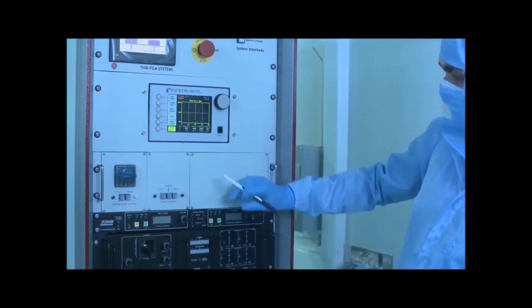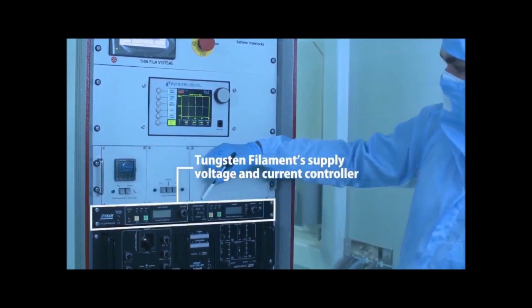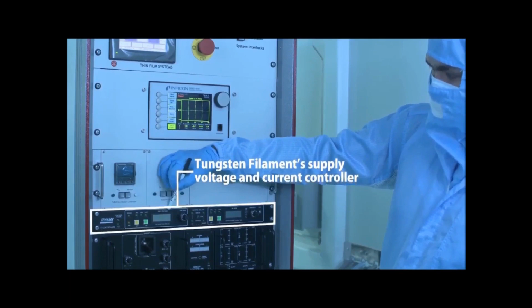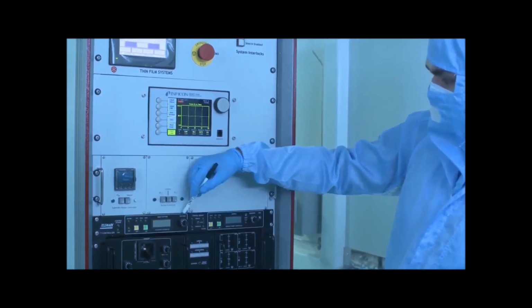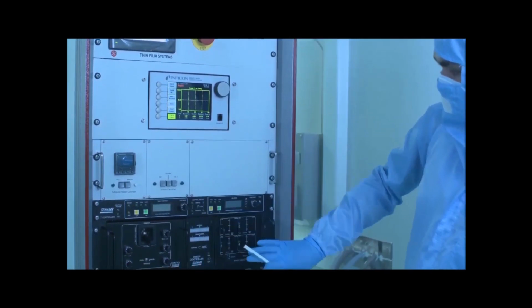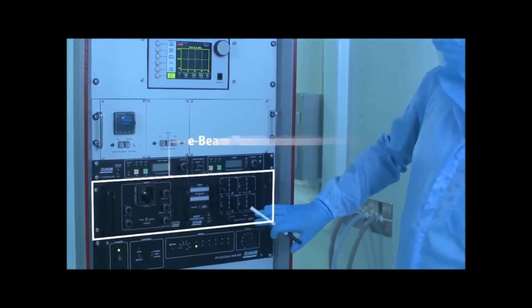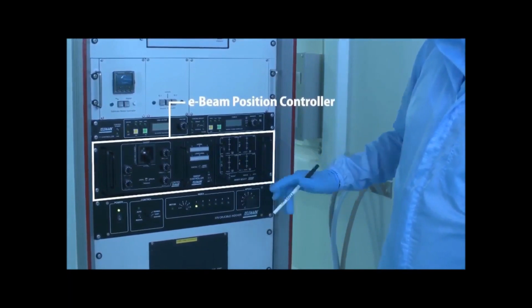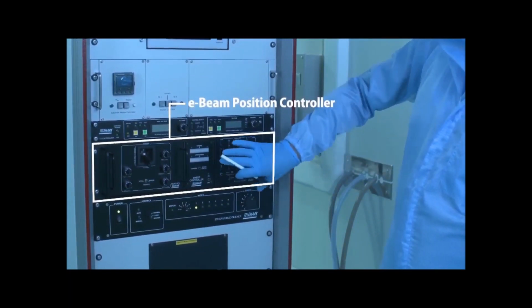And the next portion, this unit is the controller for the tungsten filament, the current and the voltage supplied to the tungsten filament. Next part is the E-beam sweep controller. So we can control the beam's position, size, and amplitude from this control unit.